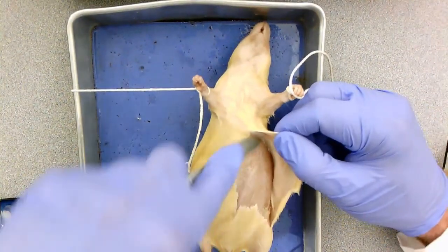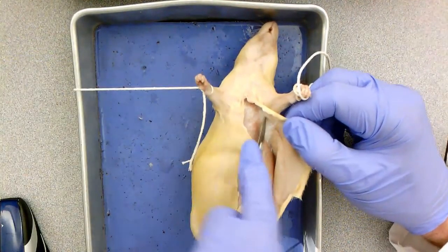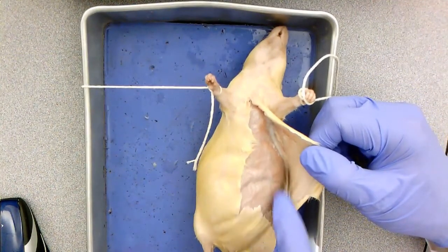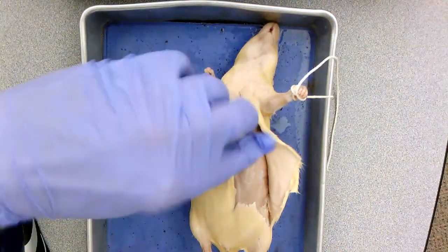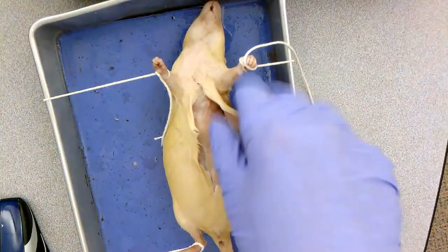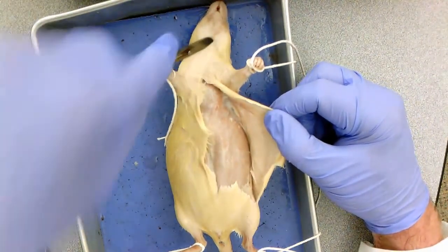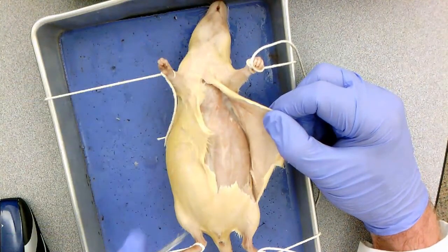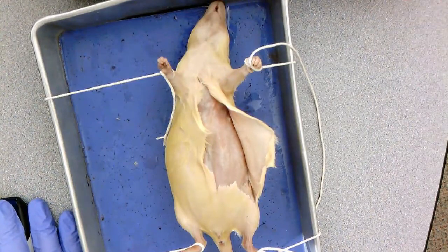All right, we're going to go all the way up here. This is where we're going to go as well, and we're going to come down here, just like this, opening up that areolar tissue on the rat. You're going to do this whole thing. You're going to come all the way across this way, all the way up here, up the arms a little bit, down to the legs a little bit, and then you're going to open it up. I'm going to show you in just a few seconds what my rat looks like when I've completed the skinning of the rat and opening up the ventral body cavity.